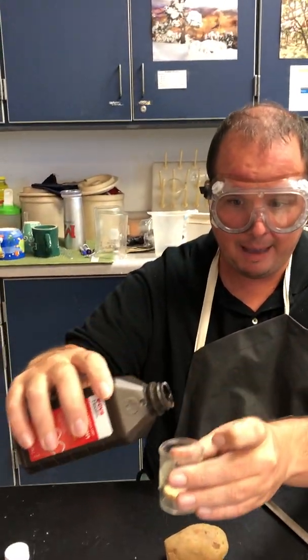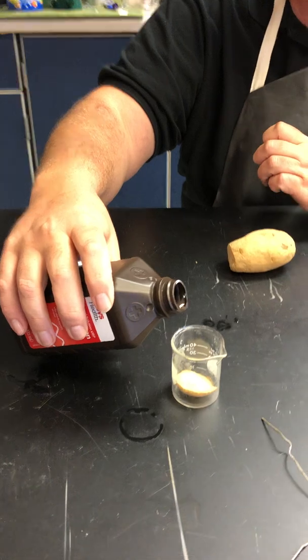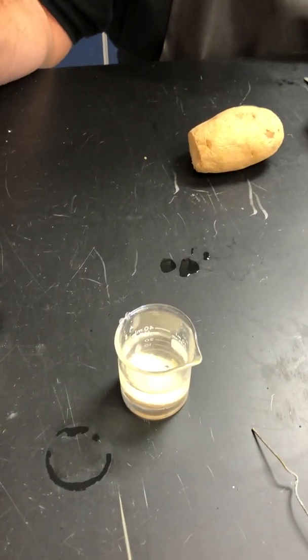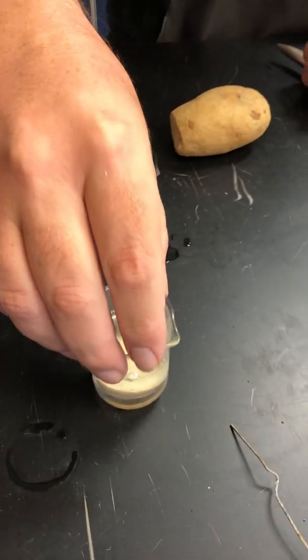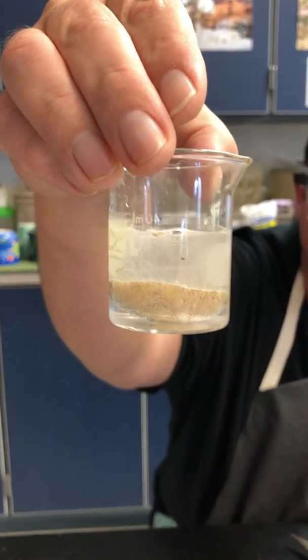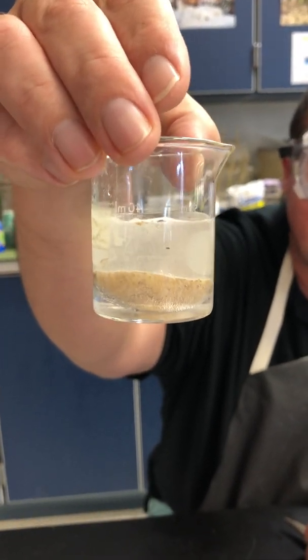So I'm going to add this H2O2, which I know pairs up with this catalase, and we're going to see what happens. I'm going to pour it down there. Be careful. So the question is, is a chemical reaction happening here or not? So what do you guys see? Can you see all those little tiny things coming off of there?